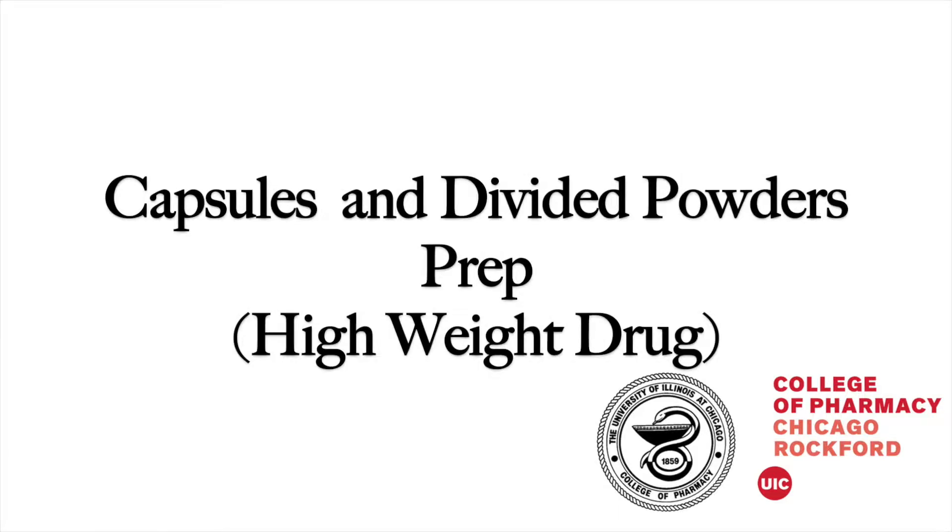For this video in the Pharmaceutics video series, we will be showing you how to prepare capsules for a high-weight drug.